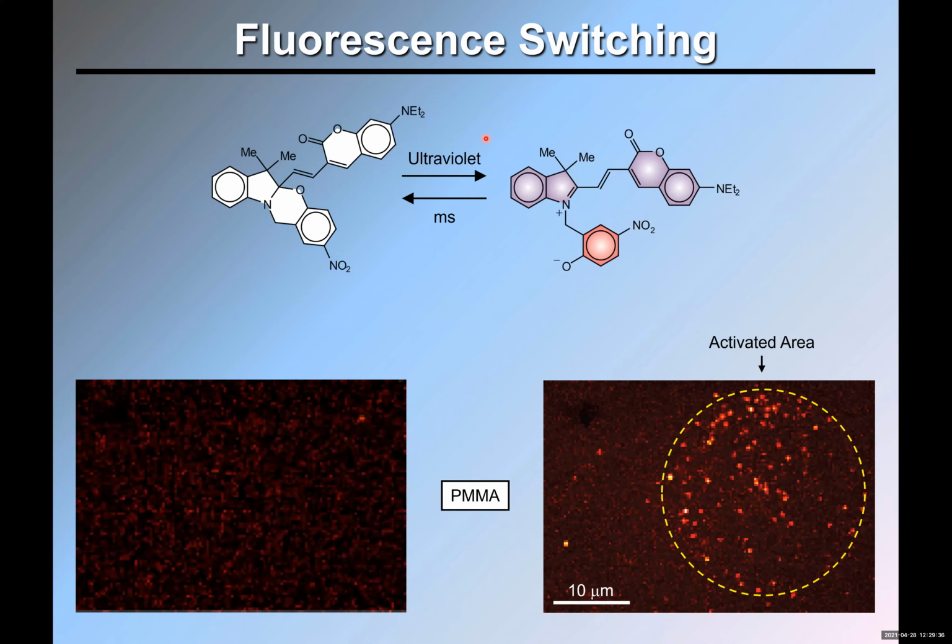So once it goes to that excited state, it emits, and then it goes back to the original compound in milliseconds? So it emits, it goes back to the ground state in this form, and then this thermally switches back in milliseconds. Okay. So that's how it disappears by itself. Yes. Okay. Now, in milliseconds in a polymer film, which is fairly rigid; in solution it is faster.